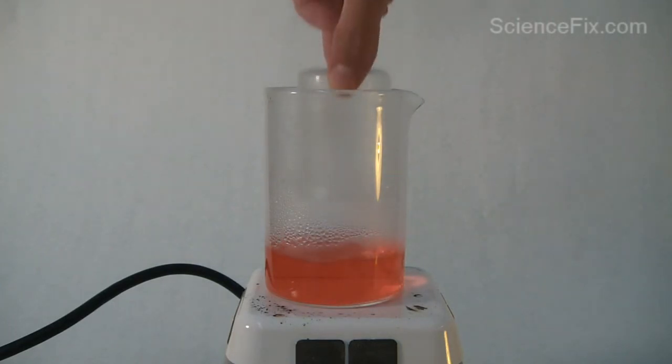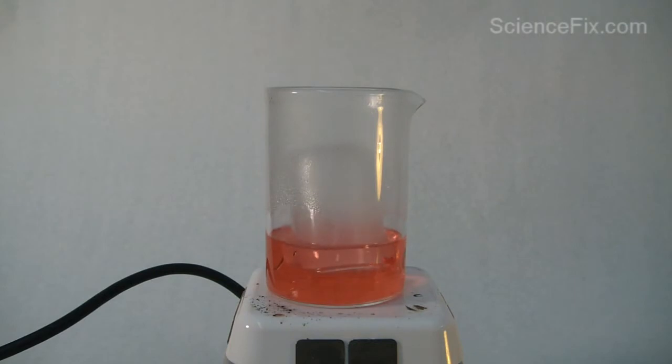On a hot plate is a beaker with some colored water at the bottom. The colored water is boiling and I just placed an inverted beaker into the bigger beaker.